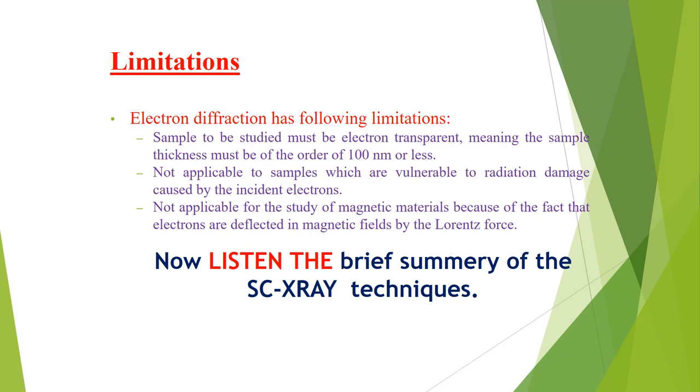The sample is illuminated with monochromatic radiation, and the sample axis phi and the goniometer axes omega and 2 theta are rotated to capture diffraction spots from at least one hemisphere. This technique is easier to index and solve the crystal structure because its diffraction peaks are uniquely resolved.